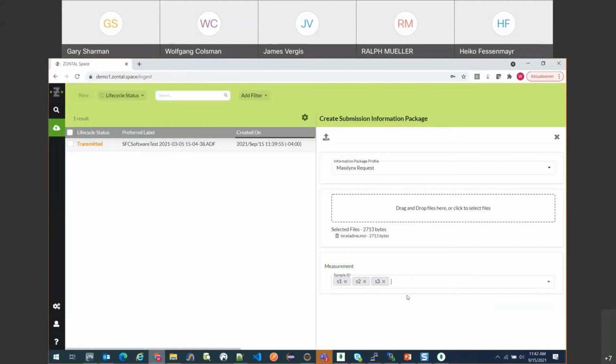In the context of the Pistoia method database project, we have defined an Allotrope model to represent a sequence, including multiple injections and method parameters or a reference to an existing ADF method. So this would then bring additional controls here into the user interface.